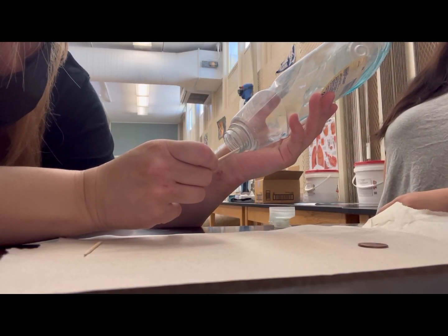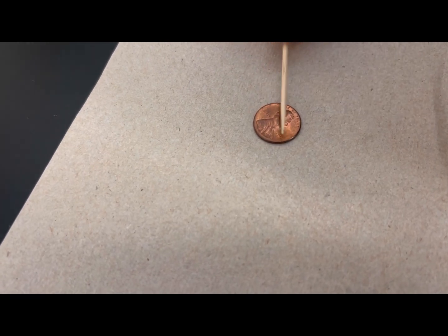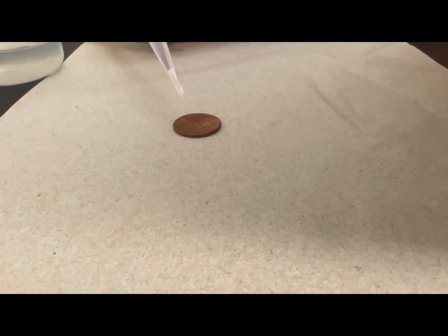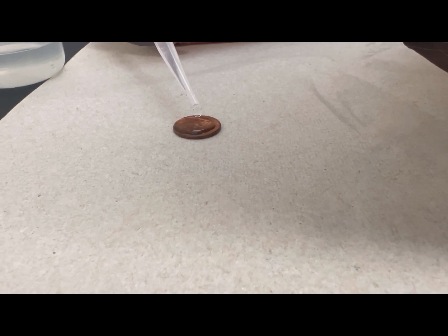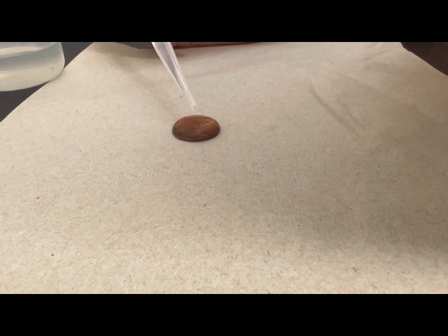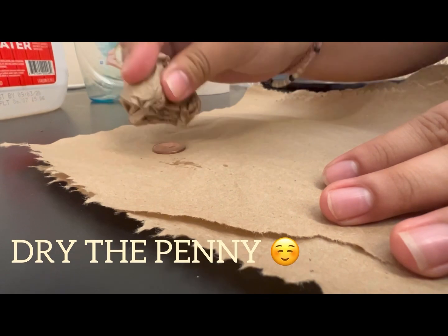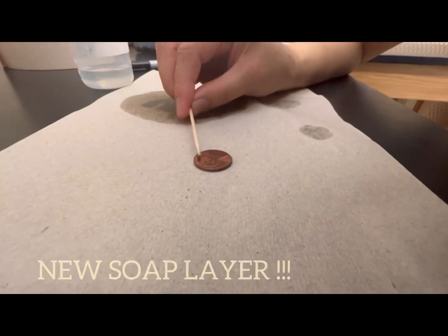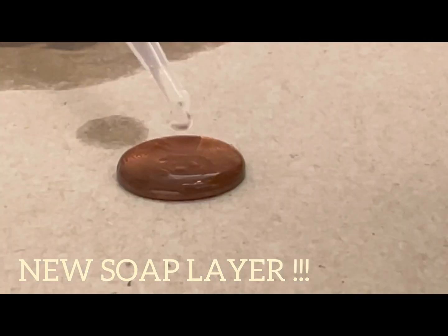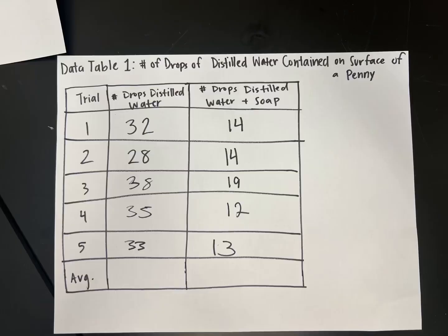So for the second part of our lab, we are going to grab a little bit of soap on our toothpick and then use it to spread a thin layer of soap on the penny. Then we will use the clean pipette to add the distilled water onto the penny with soap until it overflows. And we are still counting the droplets in order to add it to our table. So before you start a new trial, be sure to dry the penny and add a new layer of soap. And here's the results from all our trials from the control group and the experimental group.